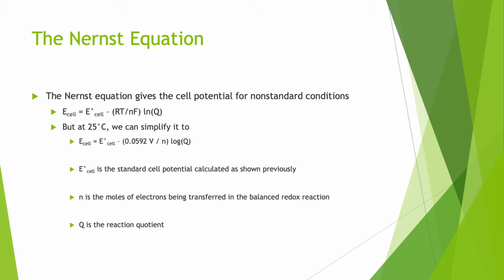All right. And what you'll be doing in the lab for your two different parts, both times we're going to be measuring just the actual cell potential. In part one, we'll be using that to find the standard cell potential and compare the standard reduction potential of copper 2+ to the known values, which you can see from the table that we saw a slide or two ago.